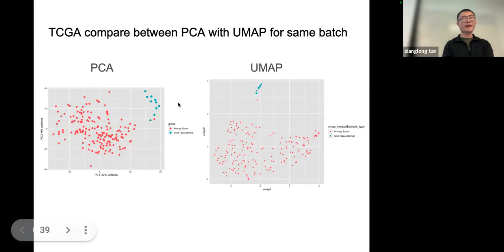If you see significant differences in the control sample clustering between PCA and UMAP, that means there are some potential issues with the data structure. So that's probably the time you should double check the quality of the datasets, or filter out the outliers or something like that.